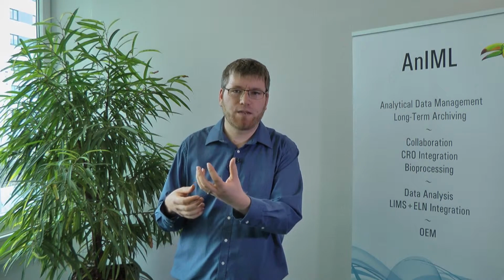Personally, I'm excited about the collaboration between the SiLA and the AnIML efforts, with SiLA being the master of instrument control, being able to communicate with instruments efficiently, and AnIML being a great representation for the data. Bringing the two together opens new opportunities, because suddenly we have an end-to-end integration possibility from the instrument, the piece of hardware sitting on the bench, all the way up to the enterprise data systems, such as LIMS and ELN systems, process control systems. And I think it's critical to realize that AnIML as a data format alone, or other standards which only provide a data format, are not enough to provide an end-to-end story. We need the communication piece so that we can actually tie in the equipment into the equation. And with the partnership between SiLA and AnIML, we have a great synergy. And at Miptec, we're actually showcasing the first implementations of that with an instrument that is working.